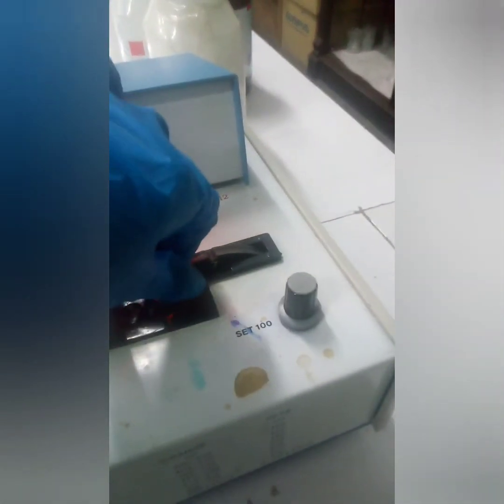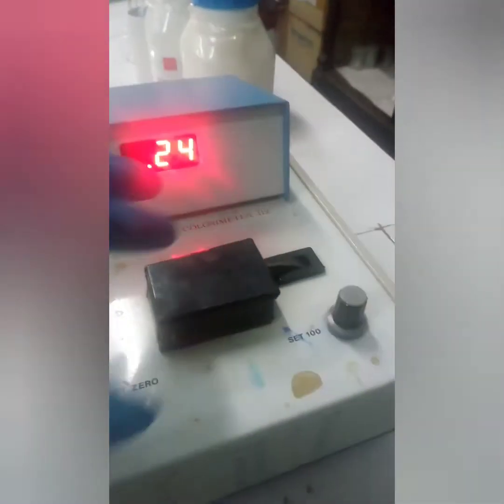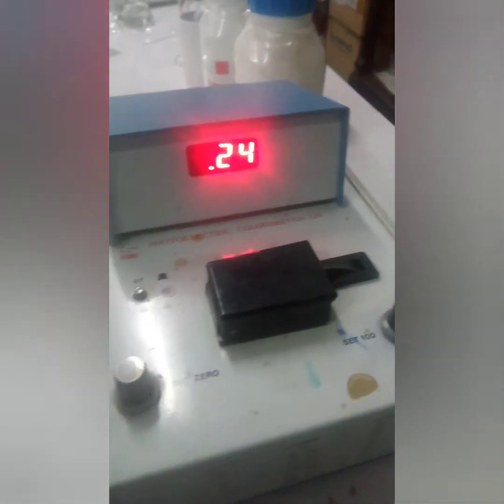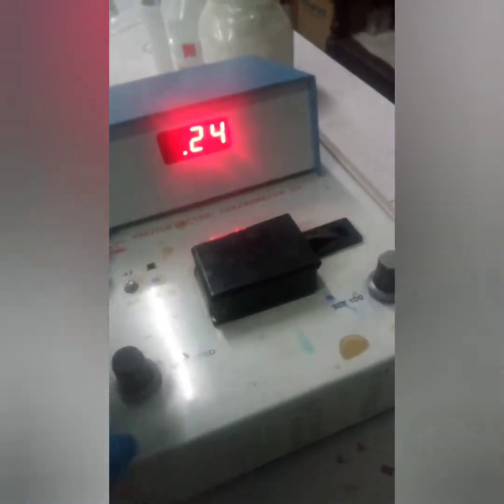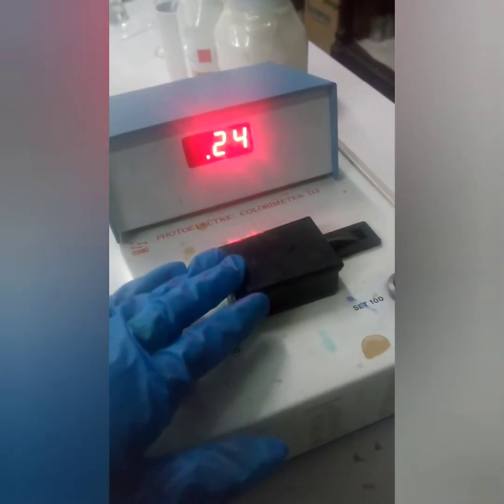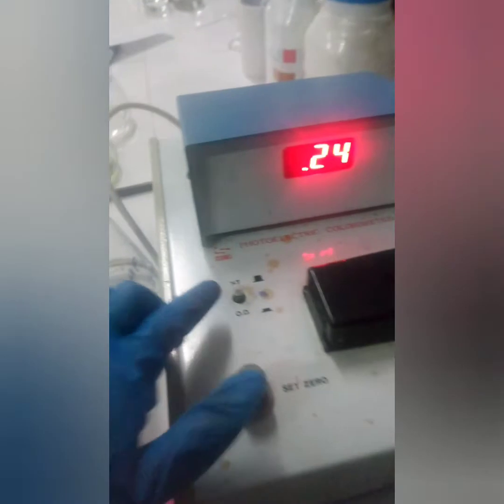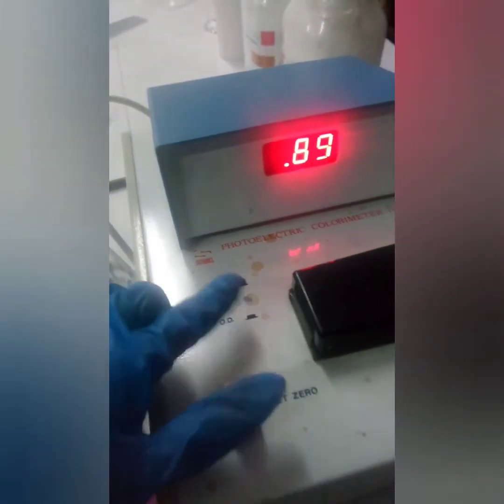This is the part where you have to keep your colorimeter tube, and then we have to cover it to prevent any light from entering. First of all, you have to set the colorimeter to 0 with the blank. I have already kept the blank sample inside, and now I will set 0.